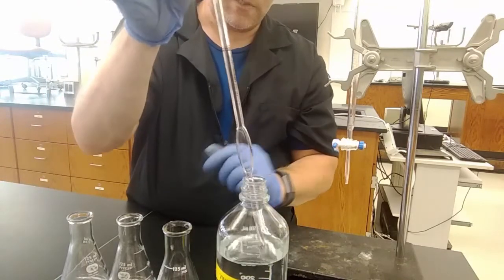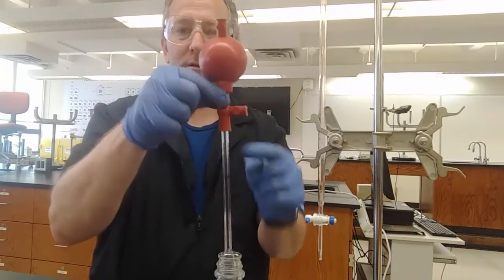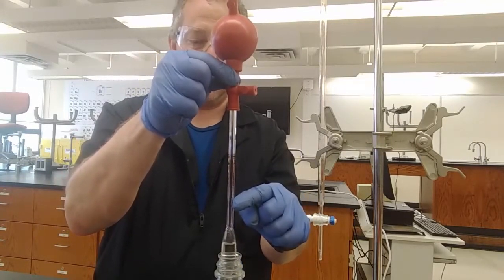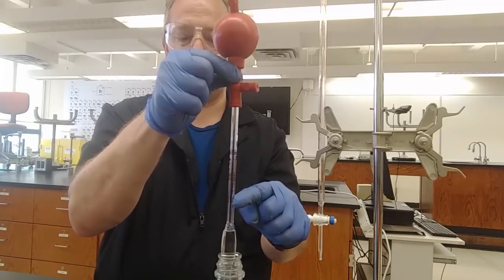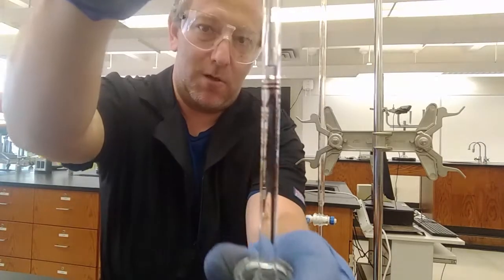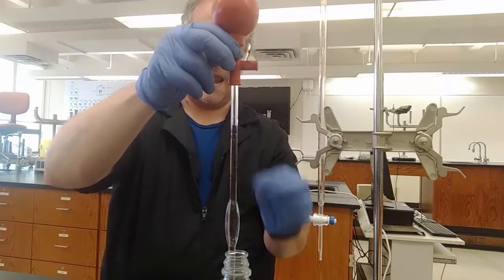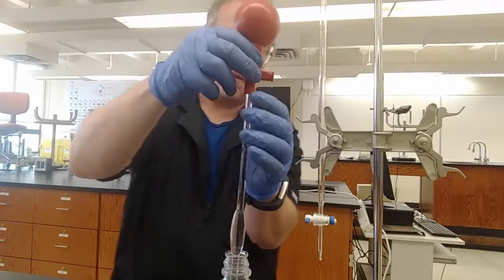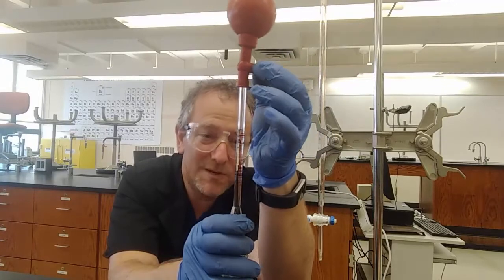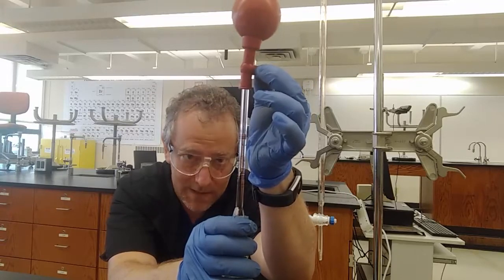And so I'm going to squeeze the top valve to let the liquid suck up into it. And I'm going to let the liquid go in past the line. See it in a second. There it is. But I'm not going to let the liquid get sucked up into the bulb. I've gone past the line, which is down here, but not into the bulb, because that would trash the bulb. I didn't let any air bubbles get in. So now, I'll press the side valve to let the liquid drain out until the meniscus is exactly on the line, the TD line, which is the top line on this one.